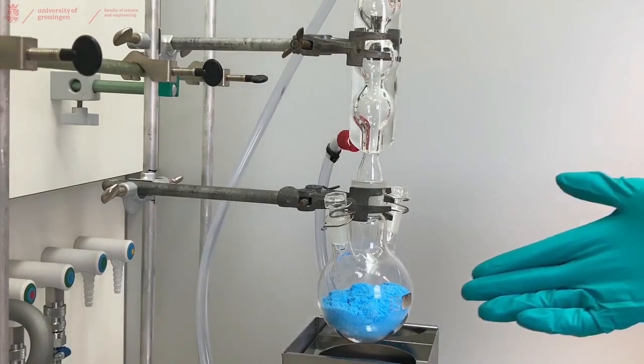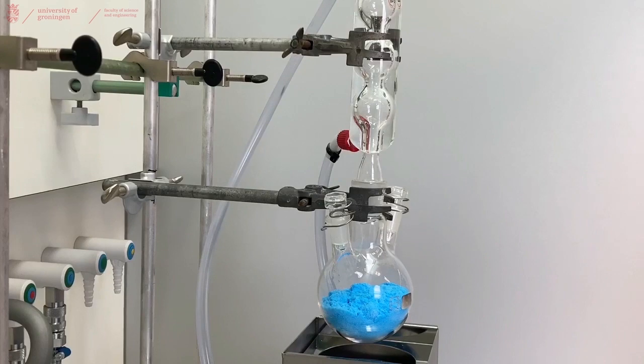We're going to recrystallize blue copper sulfate using water. I have a rough estimation about how much solvent I will need, which is about 100 ml.